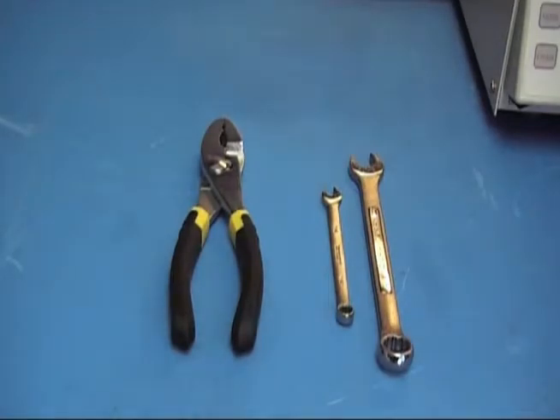The tools recommended for this procedure are a pair of pliers, a quarter-inch wrench, and a half-inch wrench.